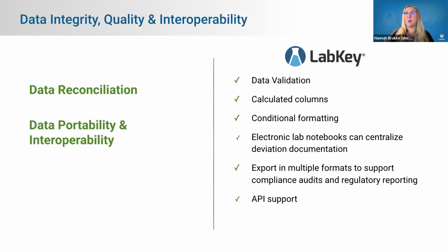And then lastly, you're also able to export data in multiple formats. So essentially making sure that you can get that data out as easily as it was to get the data in, as well as having API support, so you can have programmatic tools that either pull data out or push data in. And what we didn't add here are the built-in integrations, if you want to push your data to a data lake, for example, or to a more robust dashboard tool.